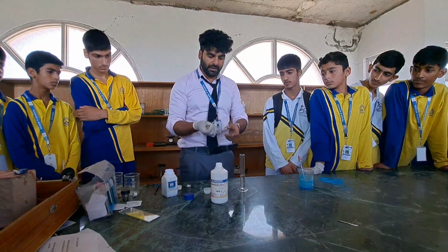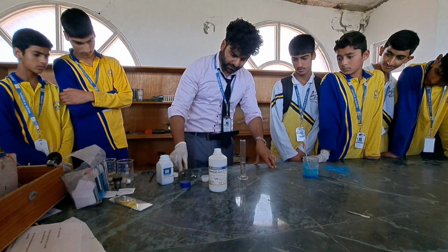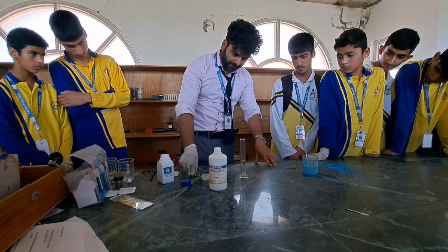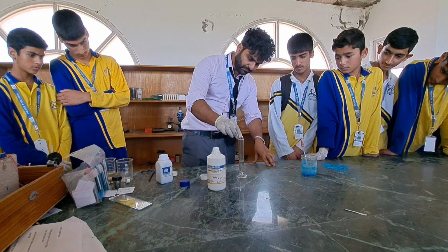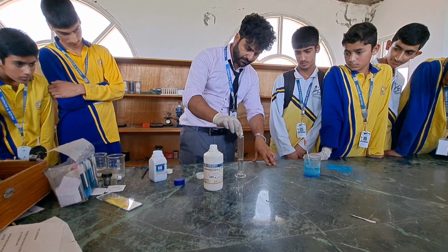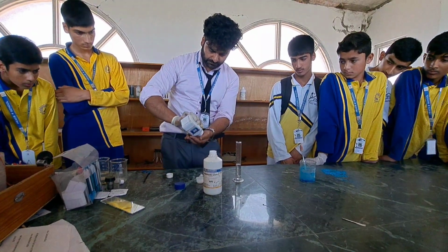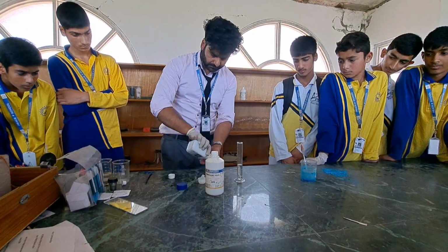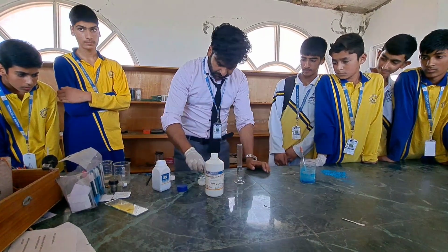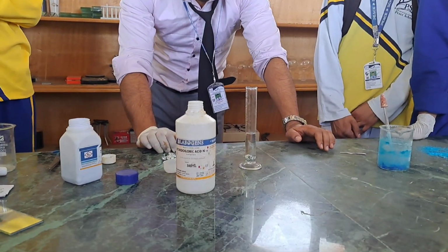Fine. So now I am putting this zinc flake, 1 piece, 1, 2, 3 pieces I will put into this, and you will see there will be a reaction in this. Wait a bit for the reaction.